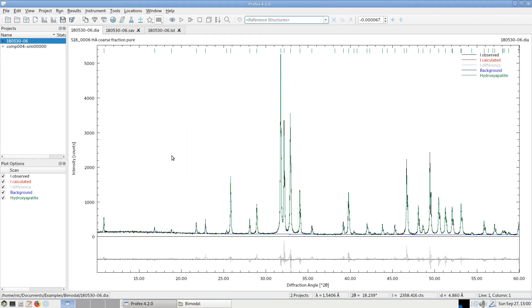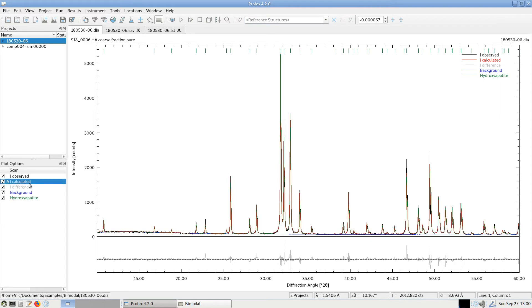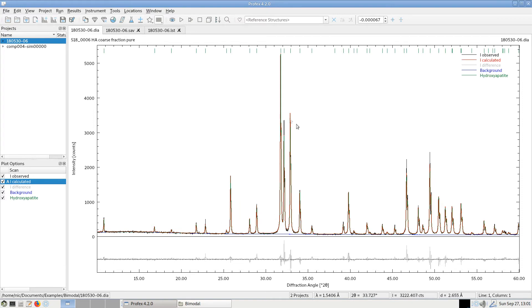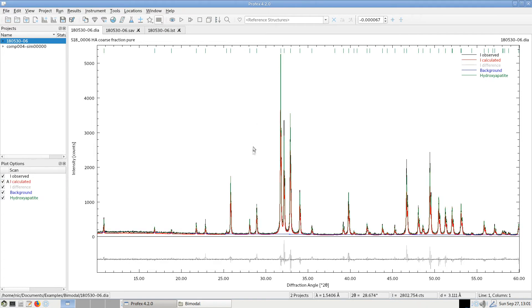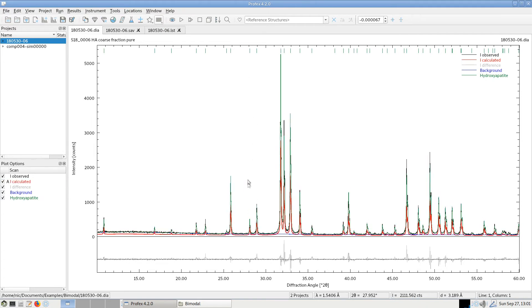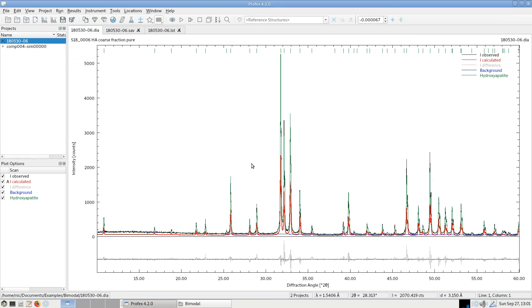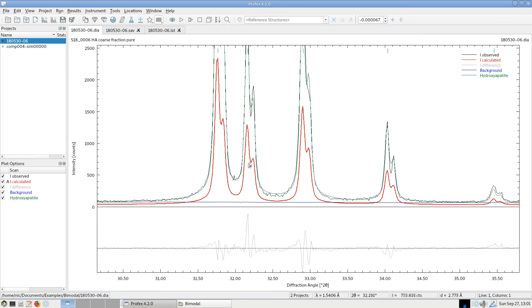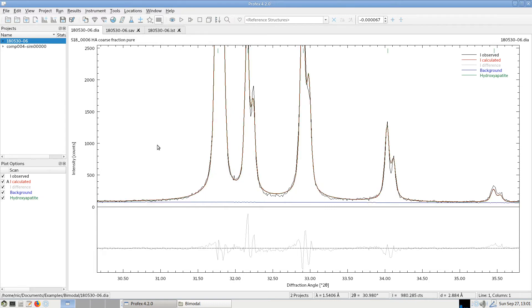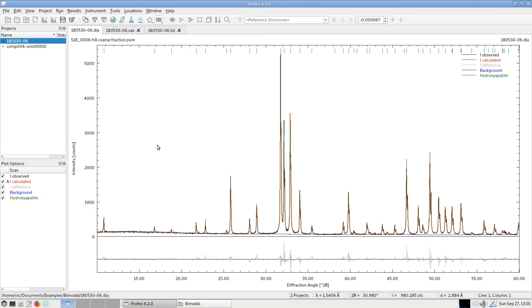If we select a specific scan from the plot options menu, for example, the red one, the calculated intensities, it will show an A letter, which means activated. And the activated scan will be drawn in a bold line. And now we can use the middle mouse button to scale this scan vertically. And if we click the right mouse button, it will first reset the scaling of this activated scan. And if we click the right mouse button again, it will reset the zoom value of the graph.